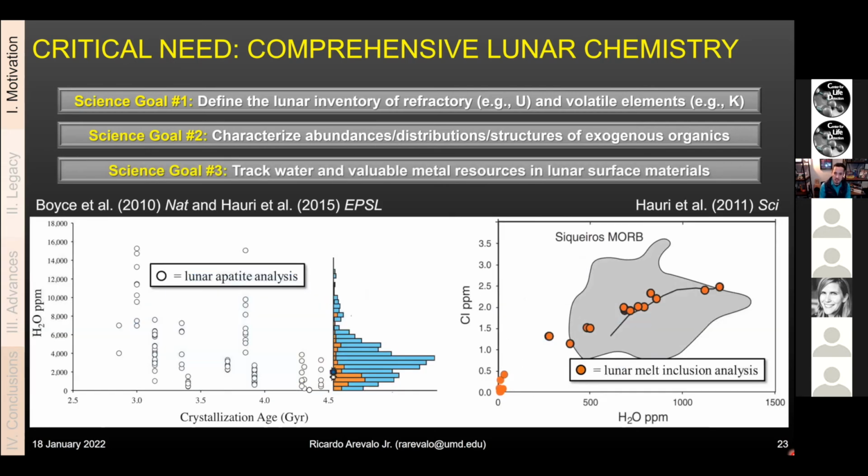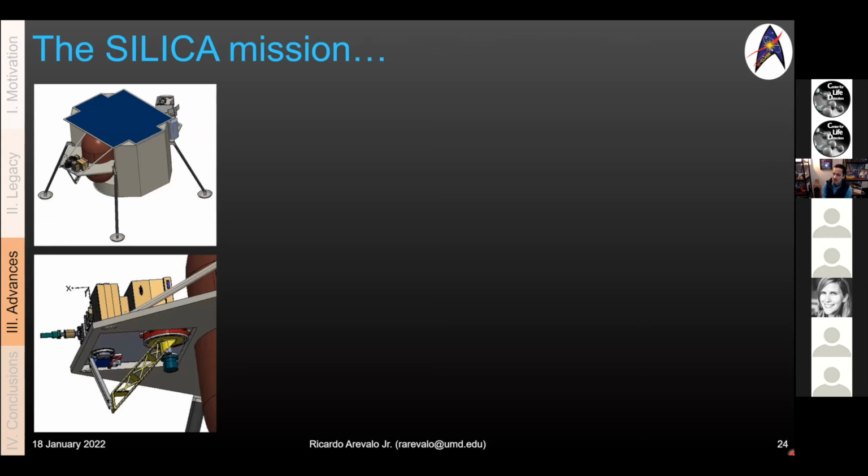And then finally, a lot of the community is interested in looking for resources on the lunar surface. So this is, I think, my last slide before the conclusions. My team put in so much work to think about how we could implement one of our laser desorption mass spectrometer instruments centered around an Orbitrap onto a lunar commercial vehicle, access material on the surface. So here is what we envision doing, putting our instrument on the deck.